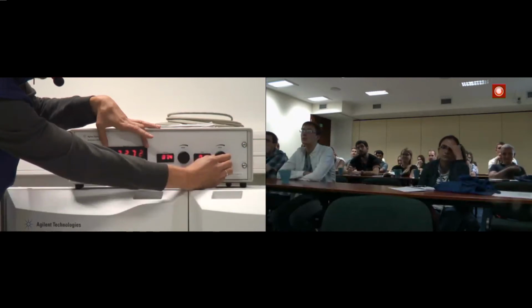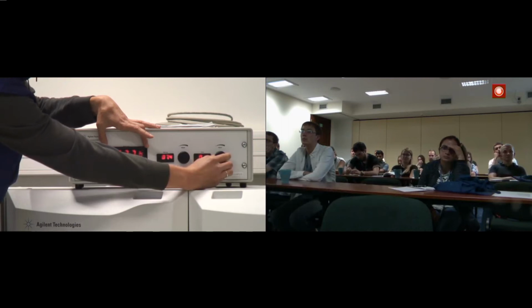So we already have 2000 rotations per second, and I would like to reach 5 kilohertz. Sometimes it is worth imagining the beauty of that device, really, because you have a macroscopic object spinning with enormous frequency.